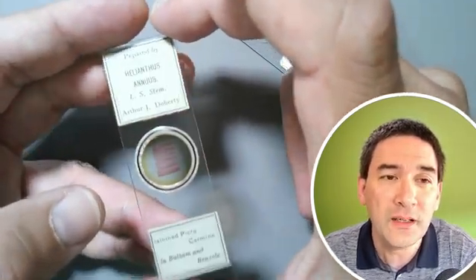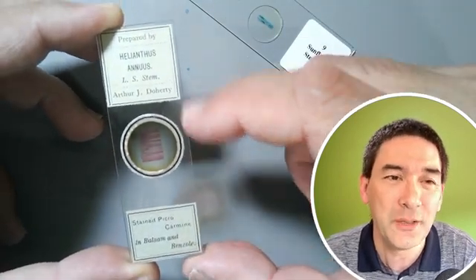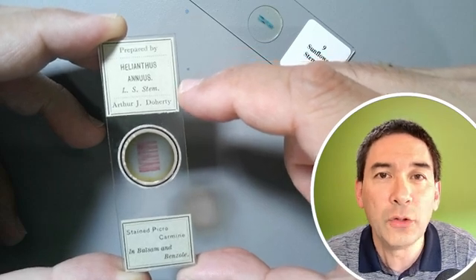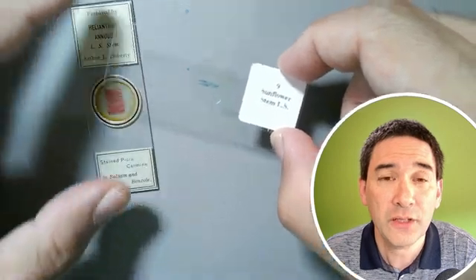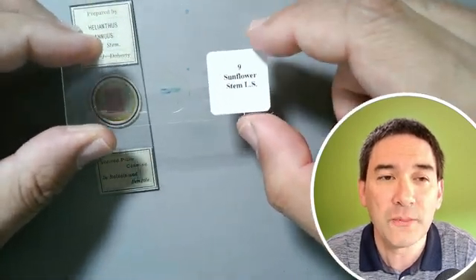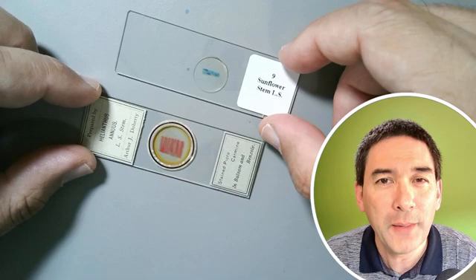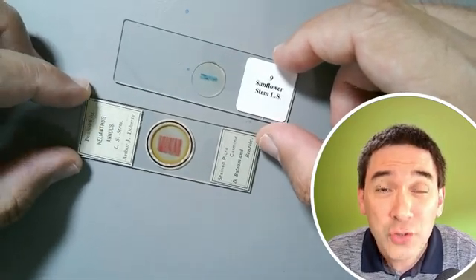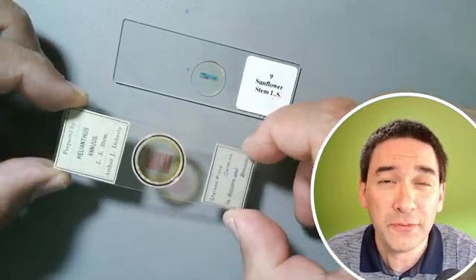The ring wasn't strictly necessary, but I think the person who made the slide used it also as branding because it looks nice. This is the Latin name of the sunflower, and 'LS stem' stands for longitudinal section. We have the same specimen labeled on the modern slide too — 'sunflower stem LS longitudinal section' — though this slide looks much simpler. Comparing them under the microscope also demonstrates what you have to be careful about when making slides yourself.